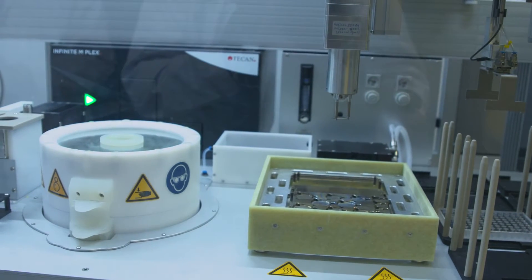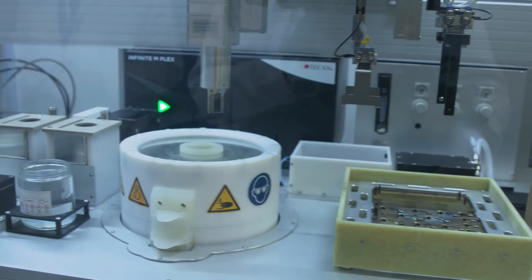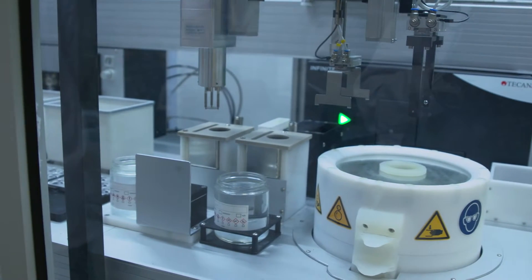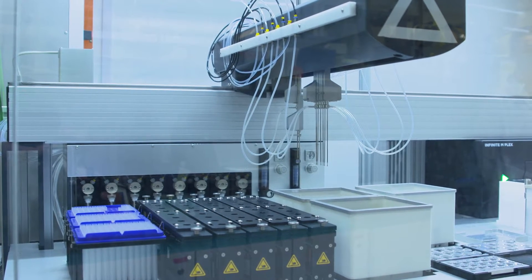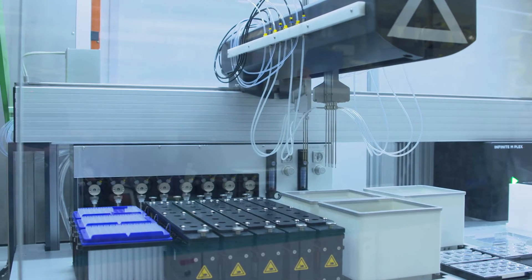We try to accelerate this process by 5 to 10 times for the traditional trial and error methodology. The lab environment is a very challenging one even for humans let alone robots. So any help that we can give them in the form of letting the robot recognize certain parts of the lab samples more easily.